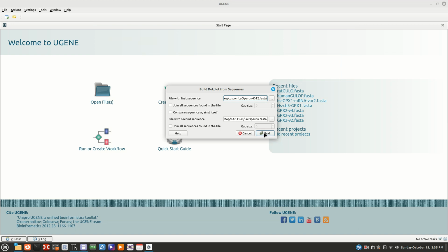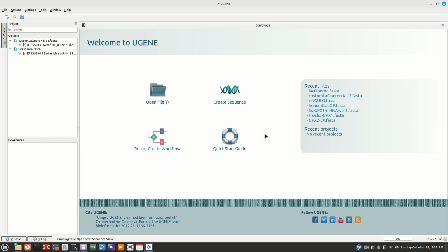All right, and we're going to look at them and see how much extra space I got on either end, and if they actually line up. If my old one was maybe a previous sequence and maybe it's changed a little, I don't know. So I assume the one I just got is up to date. The old one I got several years ago. I have not looked at it, so I don't know if maybe they've resequenced it or something. It shouldn't have. This is pretty stable, but I just want to check it just in case.